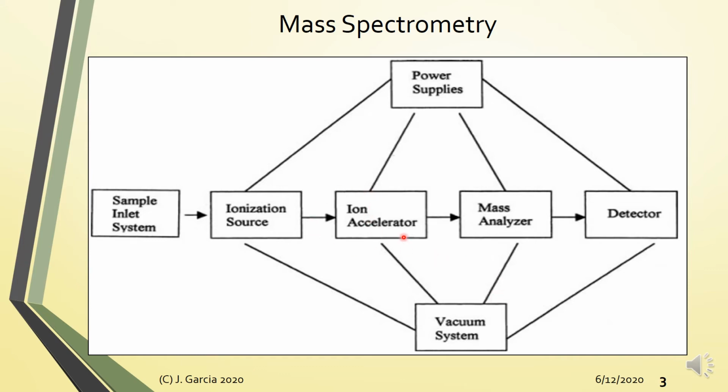Because what we have here, if you have molecular mass spectrometry, you have what they call molecular ions. So these are charged molecular fragments. So if you have atmospheric gases or even unwanted molecules inside the system, this would actually deactivate the fragments, making them lose their charge. And hence, mawawala na yung kanilang response towards the detector. Alright, so very important that the instrument is under vacuum.